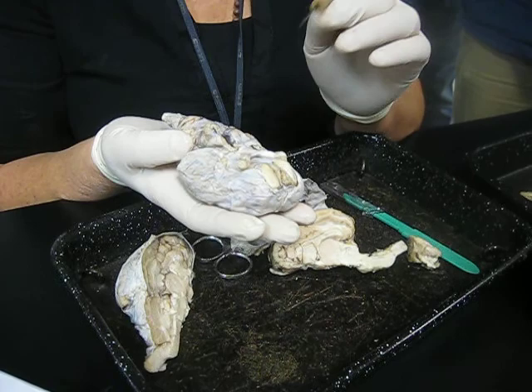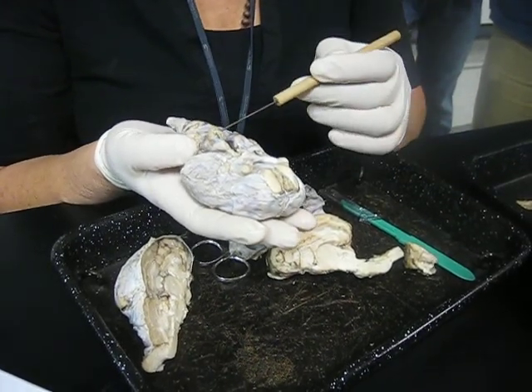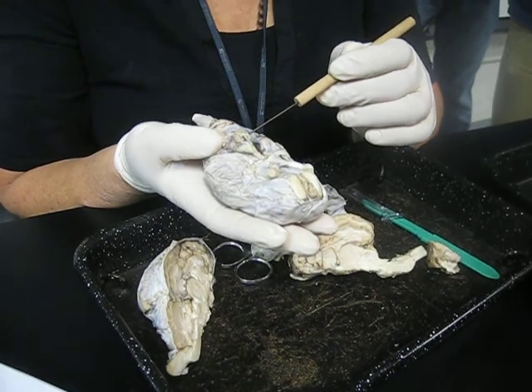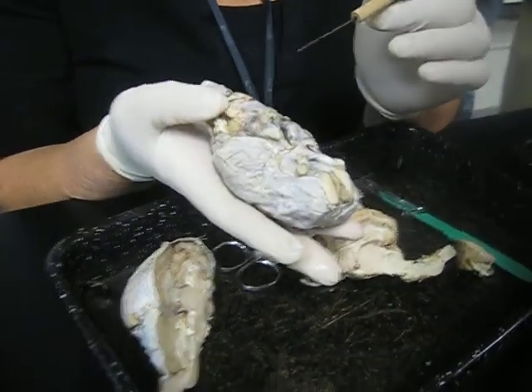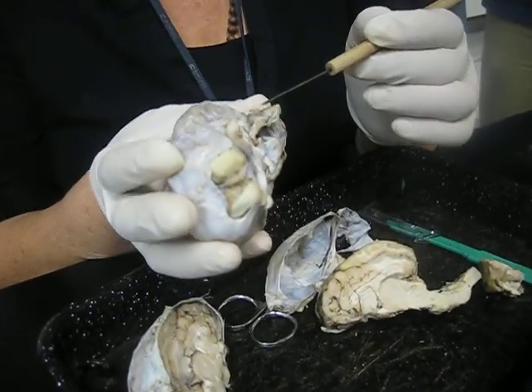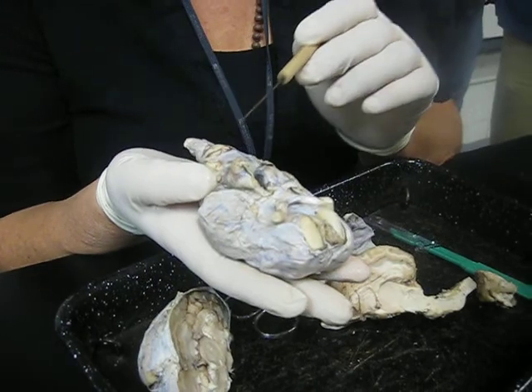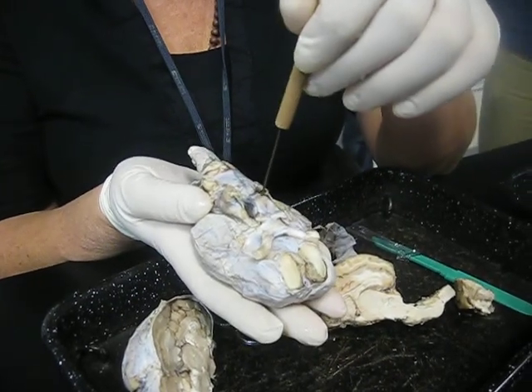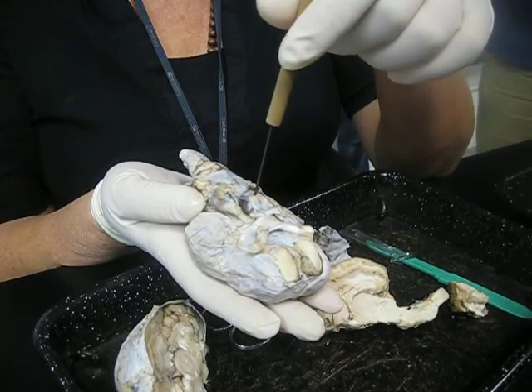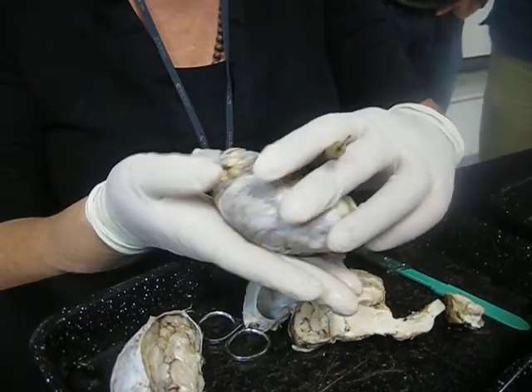Right now you just need to know the structures. Next week you'll learn what all that means. This is the trigeminal nerve. You see how it has 3 stumps? That's why it's called trigeminal. There's 3 different stumps there. But it's all one nerve, and it's cranial nerve 5 or the trigeminal nerve. Right here, this body that's lying there, that's the pituitary gland. Okay? That's the pituitary gland.